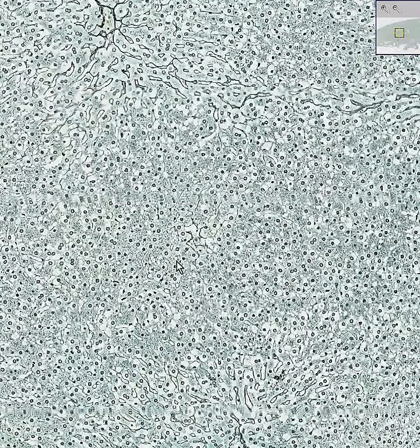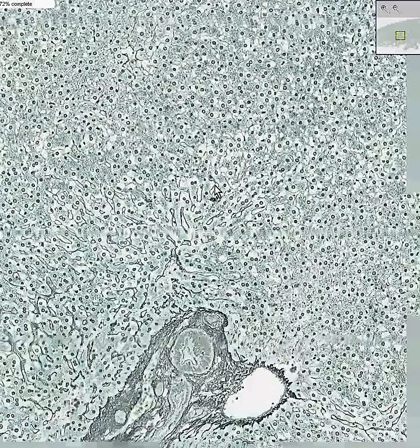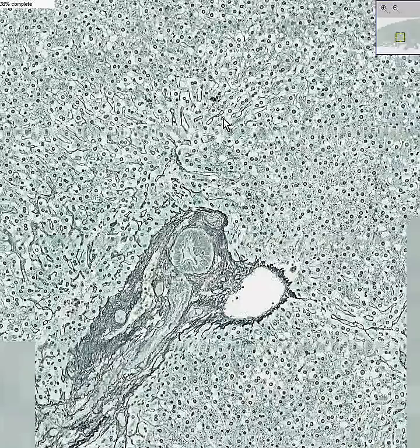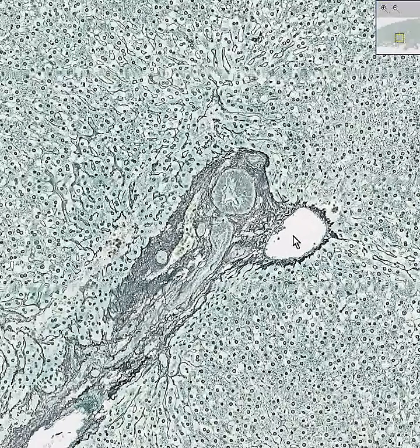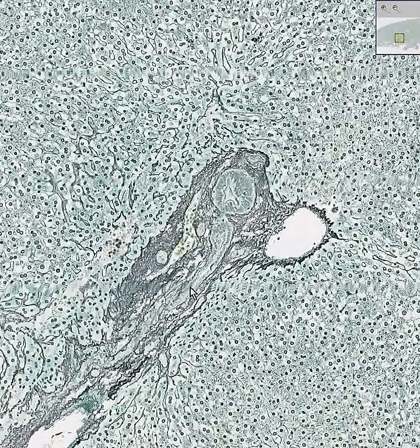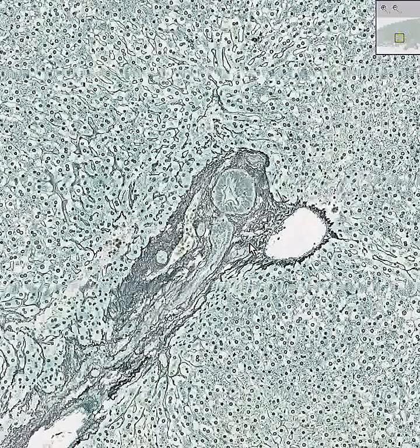Also notice that when you're in a portal area — you could see probably a vein, maybe an artery somewhere, and you can see a nice bile duct — notice how that area is particularly rich in reticular fibers, but remember it also has collagen as well.